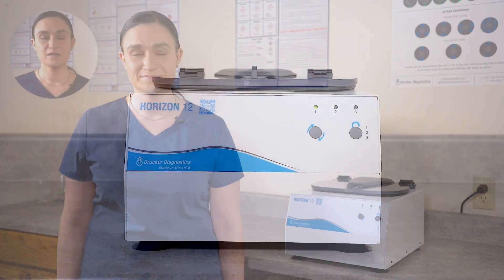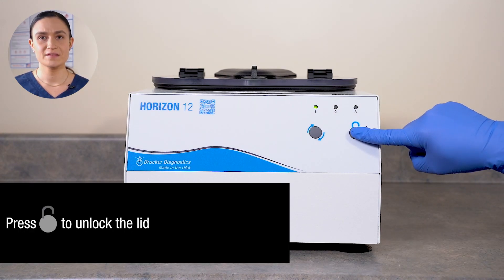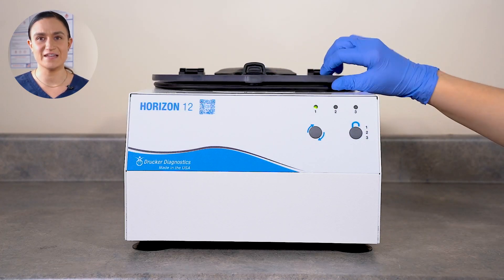Today we're going to learn how to unlock the centrifuge when its lock system is engaged. To unlock the centrifuge, simply press the stop/unlock button. The centrifuge will unlock and you can twist the lid latch and lift the lid to access the rotor.